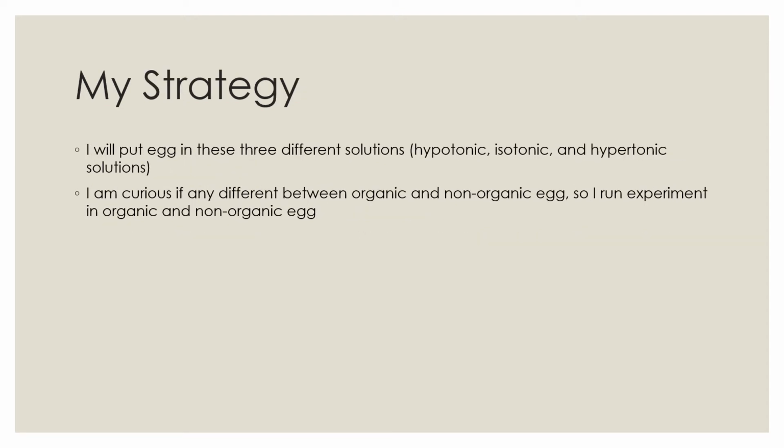My strategy: after I dissolve the eggs, I make the eggs naked. I will put all these eggs in three different solutions: hypotonic, isotonic, and hypertonic solution. As I'm curious if there is any difference between organic and non-organic eggs, I run the experiment with organic and non-organic eggs too.